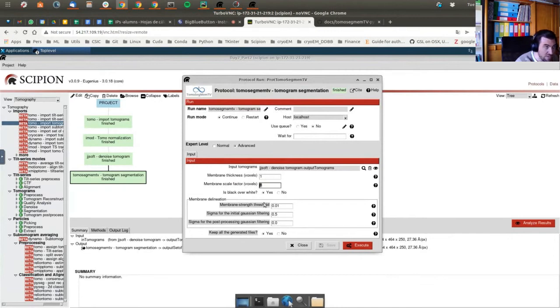This one would be higher, and this one would depend a little bit on your data set. I would use a higher value because the thicker the membranes are, the more probable it is that you are going to end up in an over detection scenario. So you can try higher values, for example 0.3, which I think is the default one, and you can observe the result, and then from that, knowing the things we have been mentioning before, you can adapt the value of the parameter.